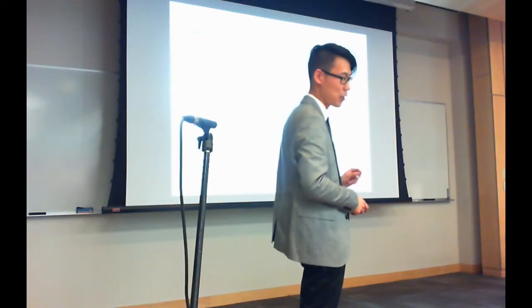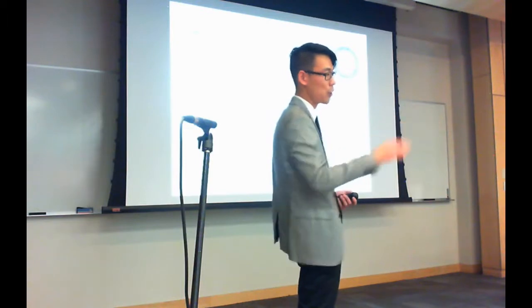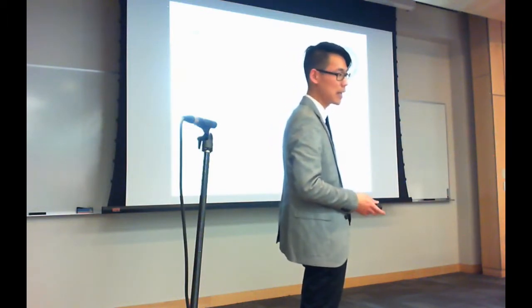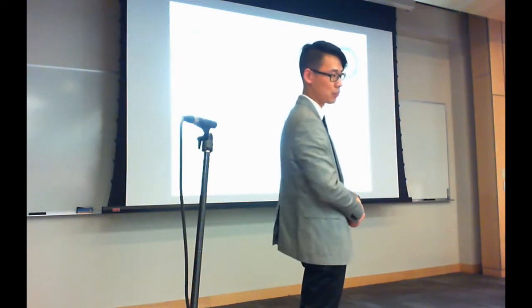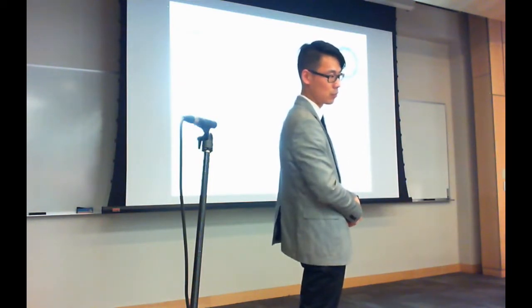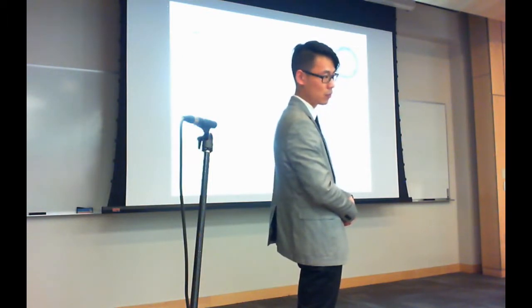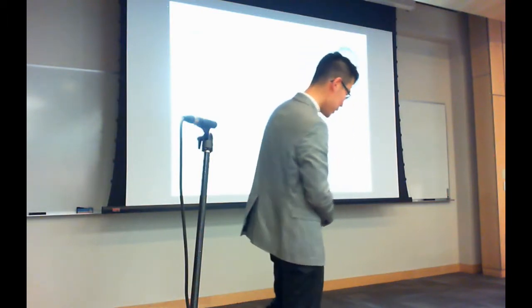If there are multiple identifications above that cutoff for a library spectrum, we throw it out. So we avoid those issues. And what percentage was that? 2% of the data were defined as ambiguous. So this also emphasizes the dangers of manual annotations, because you can do this and it's great, but somebody who manually annotates spectra can make a mistake.